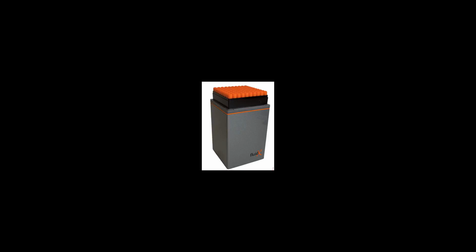While plate reader usually refers to the devices described above, many variations are available. Some examples of other devices working with the microplate format are ELISPOT plate readers, used to count the colored spots that are formed in the course of ELISPOT assays. High-throughput imagers that can measure all the wells of a microplate at once. High-content screening, HCS, systems that image each well with high resolution to look at cell populations. Label-free instruments that use specialized microplates to measure binding events without the use of chemical markers.